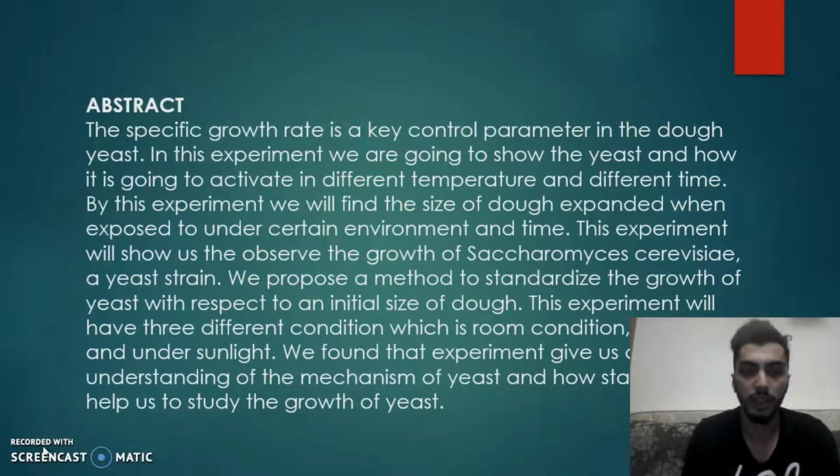Hello everyone, I am Rashad and today I am going to talk about the abstract in our experiment. The specific growth rate is a key control parameter in the dough yeast. In this experiment we are going to show the yeast and how it's going to act in different temperature and different times.